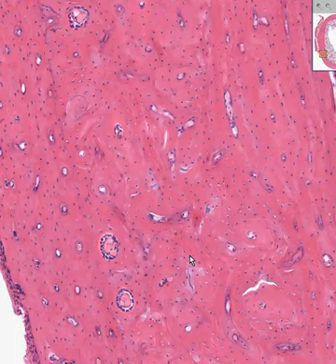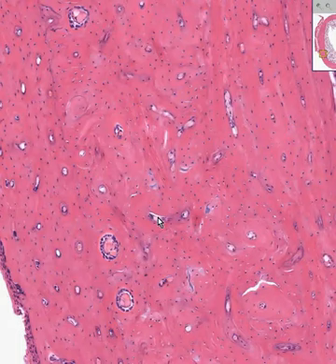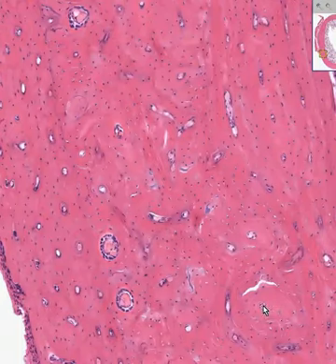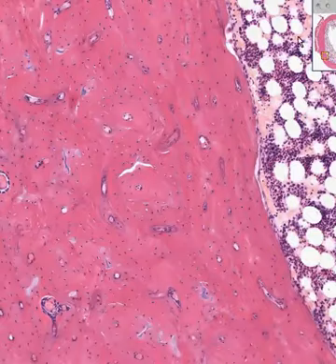Branching off at right angles, possibly here, possibly here, possibly here. Branching off at right angles from these haversian canals are what they call transverse or Volkmann's canals. And all they represent is just some more vascular connections between the main or haversian canals. So we see periosteum, endosteum, and all of these little haversian units. Let's take one like here, for example. That's a good place to start, and blow it up to its highest power.